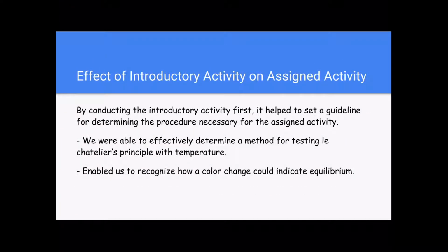Effect of introductory activity on assigned activity. By conducting the introductory activity first, it helped to set a guideline for determining the procedure necessary for the assigned activity. We were able to effectively determine a method for testing Le Chatelier's principle of temperature, and this enabled us to recognize how a color change could indicate equilibrium.